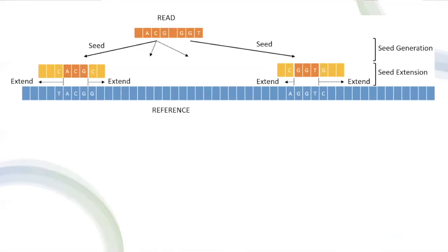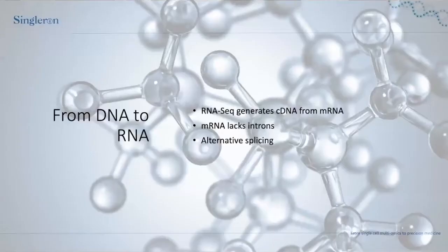So this is basically how it works. If you have a read that looks like this, you find a seed for it. So ACG matches ACG, and then you start extending and see how many matches or mismatches you get, and then you start scoring them. I will not belabor that point because we have limited time.